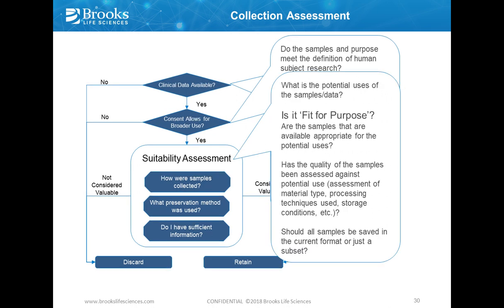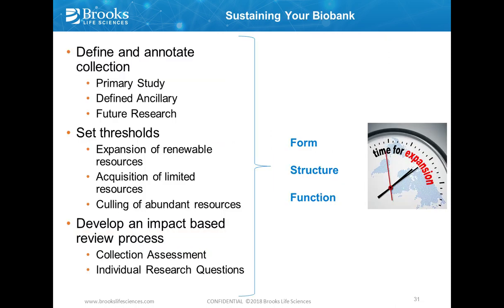So we have all this in place. The sample seems to be quite usable. We should keep it. That means after a final suitability assessment: what is the potential use of the sample? Is it fit for the purpose? We may have to take the decision, yes, it is, and then we keep it. But going through this scheme, asking these questions, helps you to really build and maintain a biorepository that suits your purposes, that has the quality you need, and that has also the amounts you foresee and you can afford for your future activity.